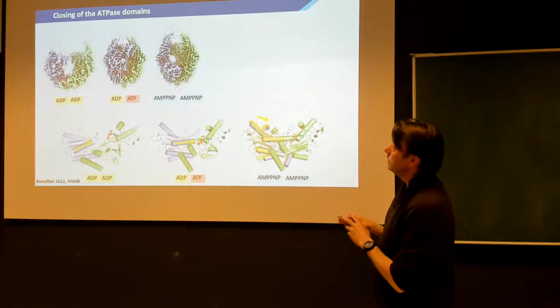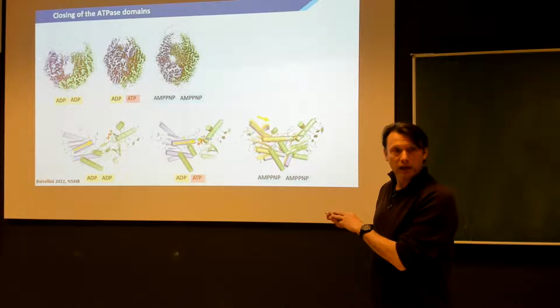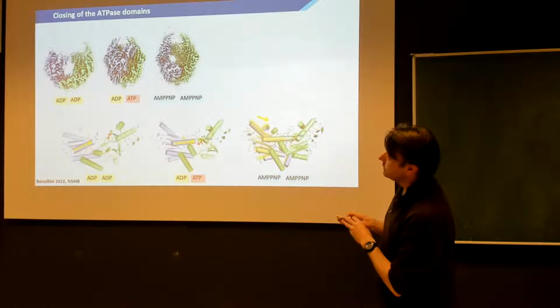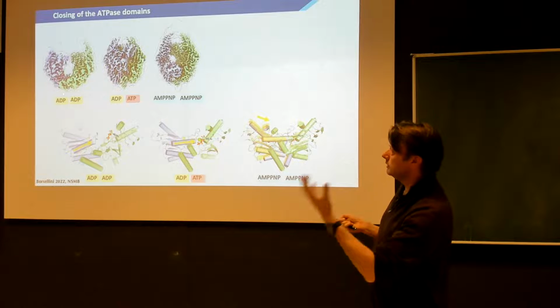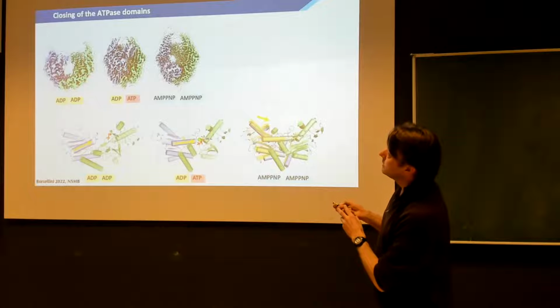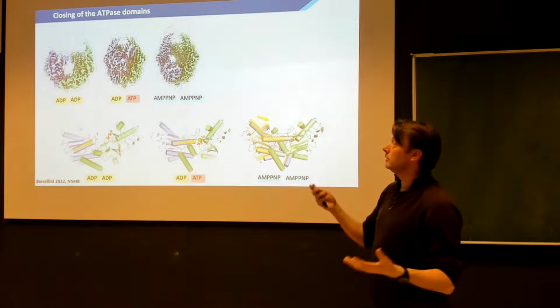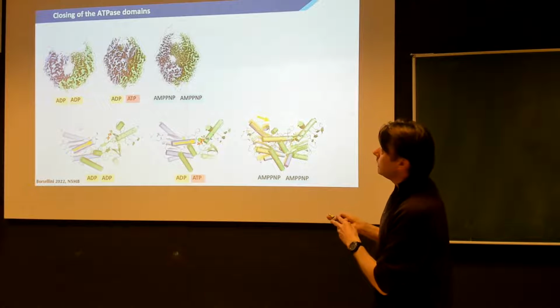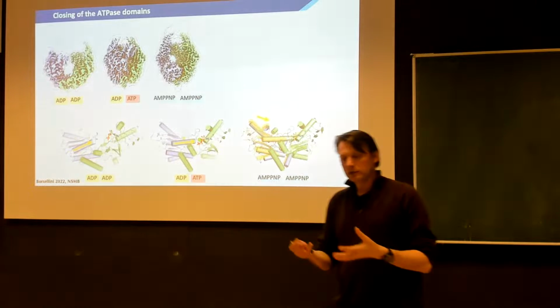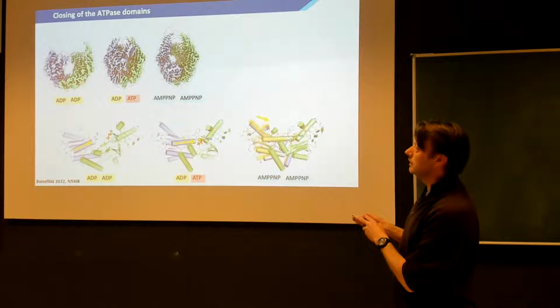And so for this, we did cryo-EM on MutS here at NeCEN in the absence of DNA, but in the presence of different nucleotides. When we use ADP, which is the hydrolyzed form, which is the one that will bind to DNA initially, we see that the complex is open. And actually, the long arms on top are so flexible we don't even see them. They're just moving about so much because there's no DNA. When we give it ATP, because of the time that we take to actually make the grids, we find that one of the monomers has hydrolyzed ATP and the other monomer has retained ATP.